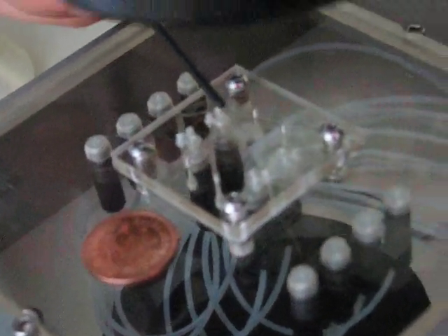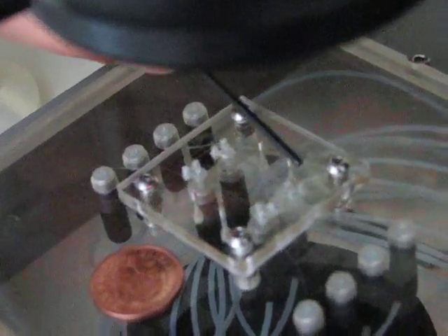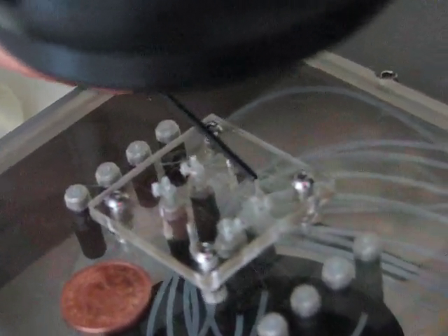Yeah. It starts from this point. So, this is the intake of the fluid. And this is the outtake. So, this is the length of the entire experiment area. Yeah, that's right. Great.